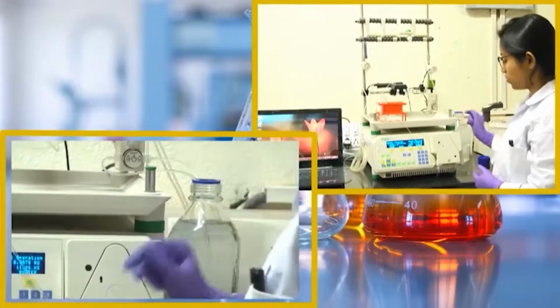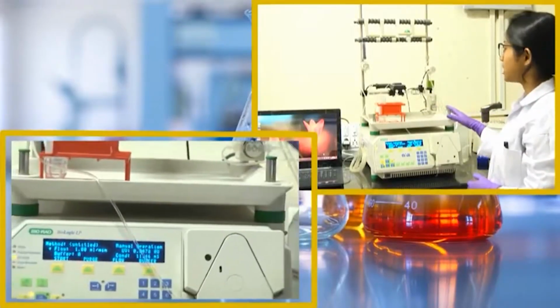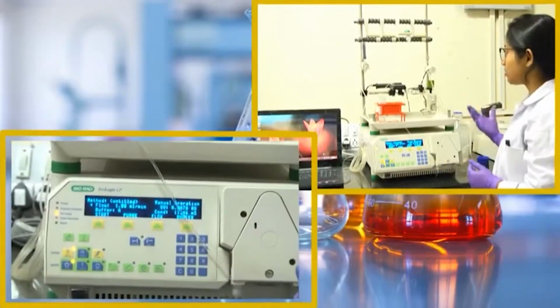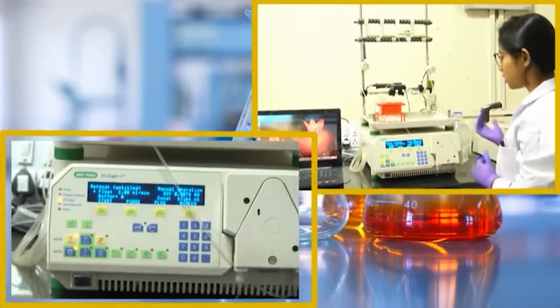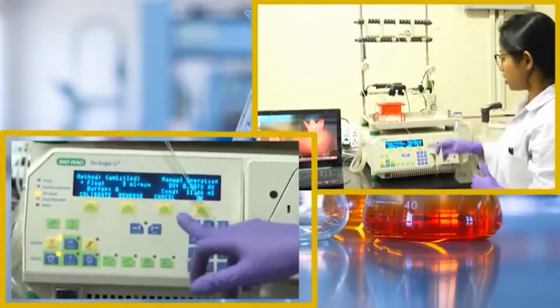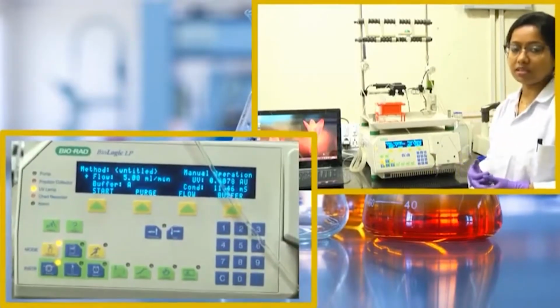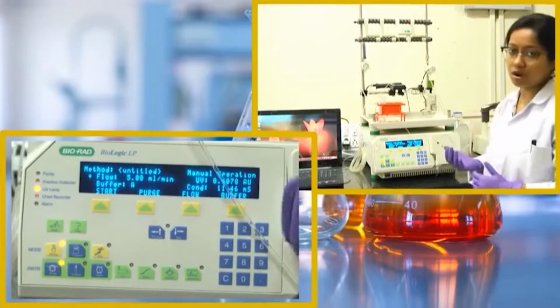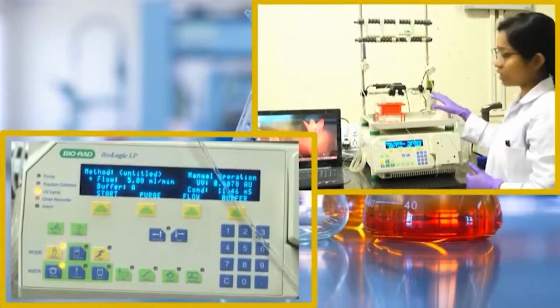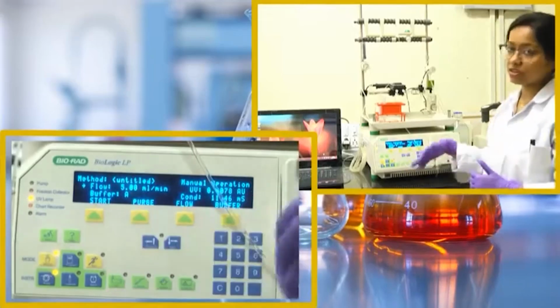We are using milli-Q water, and now we will run water through all these channels and the column as well. First, we need to clear out any precipitated salt or alcohol that is present and get it out of the system. This column can withstand a 5 ml per minute flow. Always check the column's requirement and do not go for a high flow, as it might damage the column. Depending on the column you are using, you change the flow.